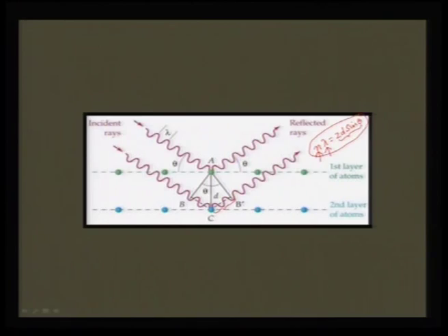This is d and this is your sin theta, and this is your sin theta. So, this is actually 2d sin theta. So this is what we are measuring.